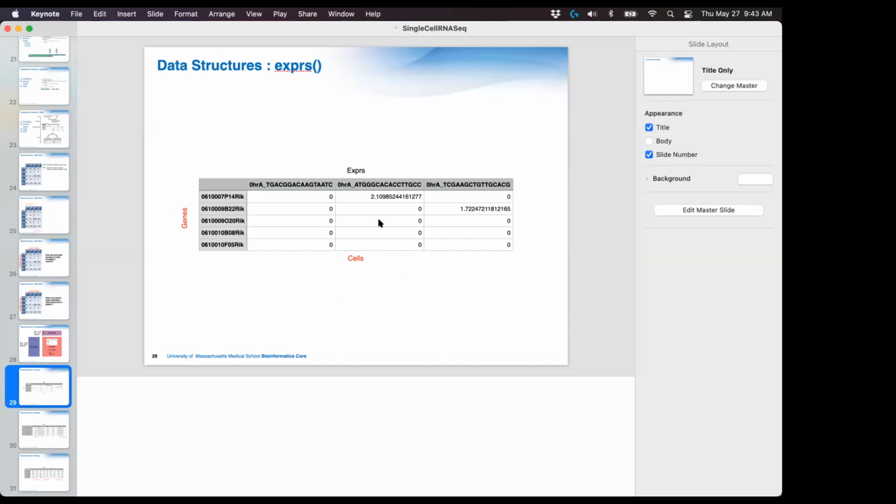Another thing to keep in mind is that if you do decide to go the single cell route, where it really excels is helping discovery. From single cell, you might get some indication that there's a rare subpopulation. Now you can run a flow experiment where you sort out that cell type you've found, and then do bulk RNA-seq on that flow sorted experiment. So you don't have to worry about cell heterogeneity. You already know exactly what cell type you're after. That's a good way to use single cell for discovery and finding what niche populations might be there.